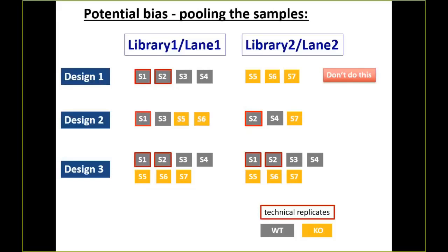At the very worst, I'd have to basically redo the experiment and say something went wrong here that I can't account for. I don't know why. And ideally, I'd be able to figure out at least something was wrong with the flow cell lanes. By comparison, in this experiment, I couldn't tell you if one of these lanes got sneezed in. So I'd just go ahead with the data, and I wouldn't know that some of the differences in these mice were because somebody sneezed in the lane.